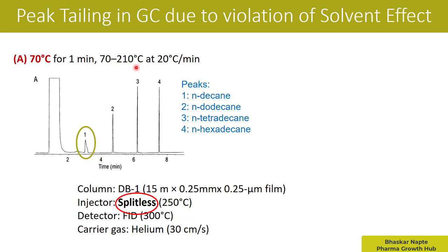Now let us look at peak number one, which belongs to N-decane. You can easily see that it is not a proper peak — it is completely distorted, having a lot of tailing.